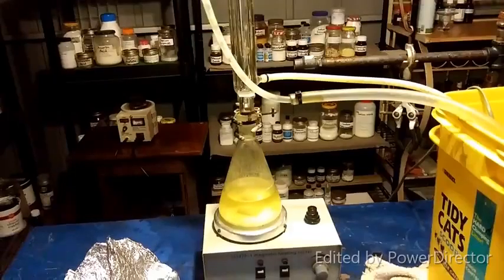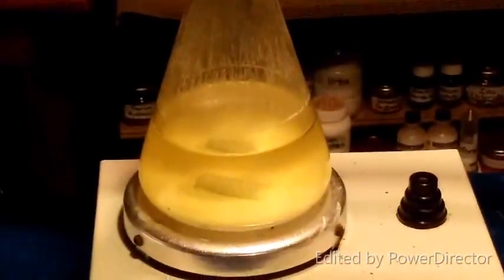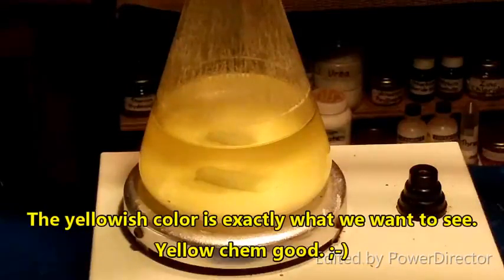Okay, everyone, here we go. This is our reaction mixture. Let me zoom you in here a little bit. It has sat here the entire day. I actually got caught up doing work a lot longer than I would have liked. But it sat here in the dark. I left the condenser running all day so nothing could evaporate away.